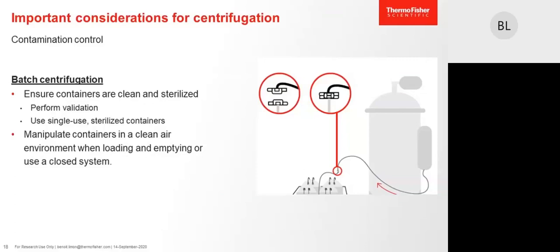So the process is completely closed. There is no cleaning and sterilization involved, and the container, the tubing, the connection, everything comes sterilized, ready to use, and this is reducing the risk of contamination.